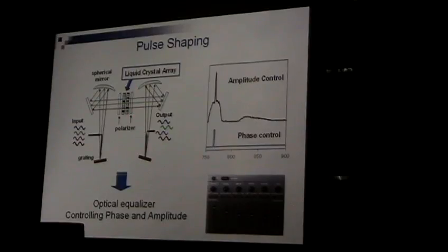Then here, you put a liquid crystal array. This one is 1 dimensional, and we use a double layer for a special purpose. So you spread all these different colors in this spectrum, with different colors at different spatial positions, and you can manipulate the phase, polarization and amplitude at each independent position by basically changing the polarization of your light, just like your notebook monitor does.